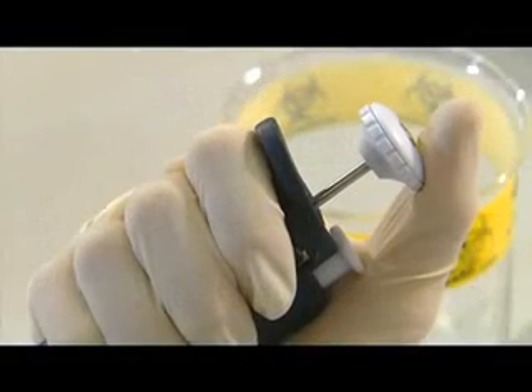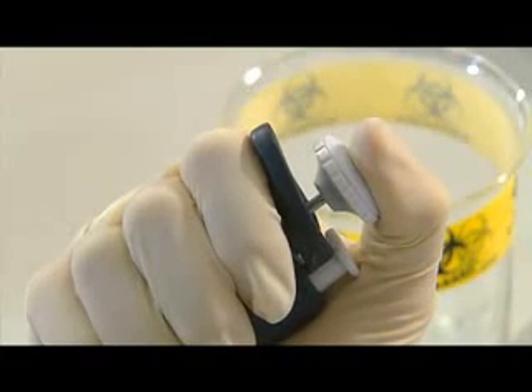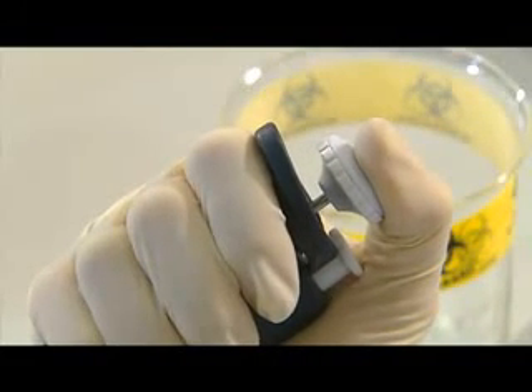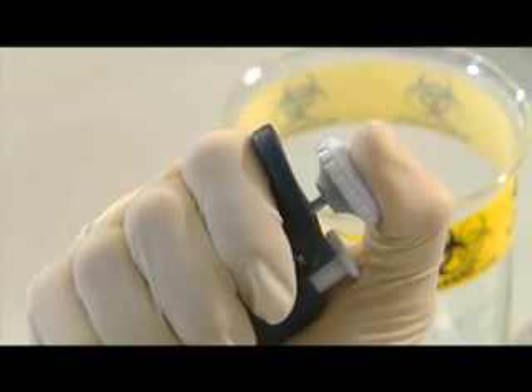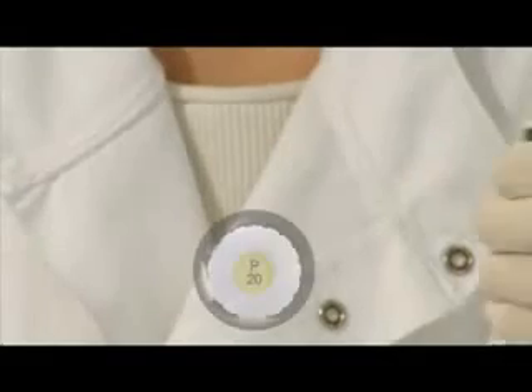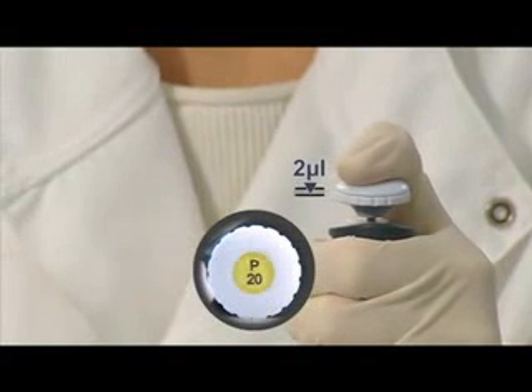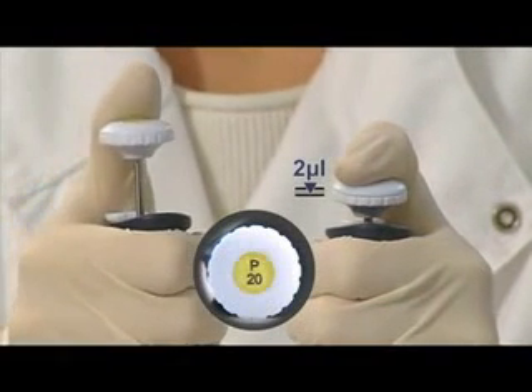Liquid is drawn in and expelled using the pipette's push button. Gently apply pressure to the button with your thumb until you feel a natural stop. This is called the first stop. The distance you need to push the push button down will vary depending on the volume you require. A P20 set to 2 microliters will require less push button movement than a P20 set to 20 microliters.